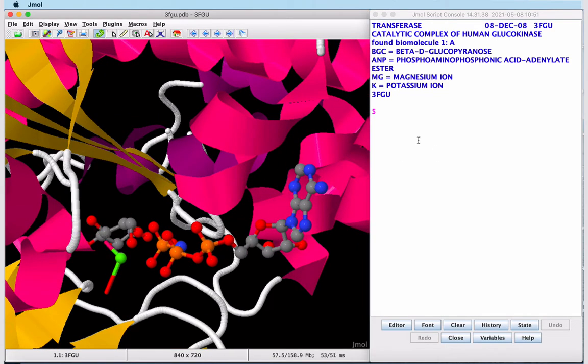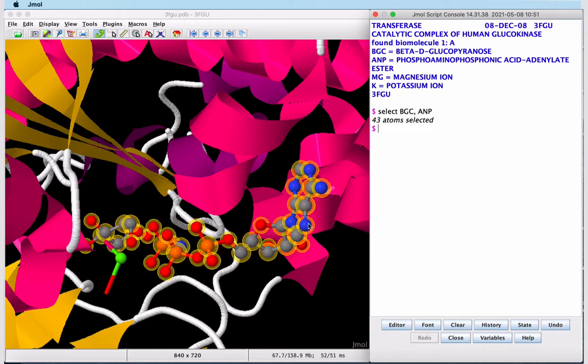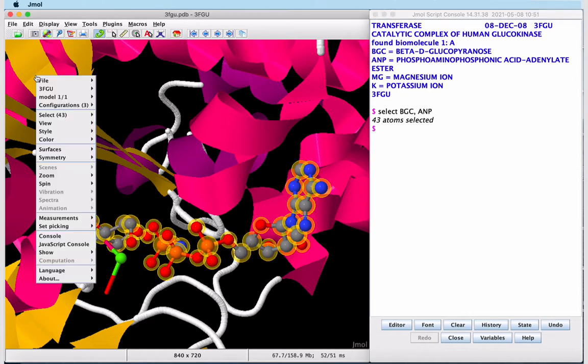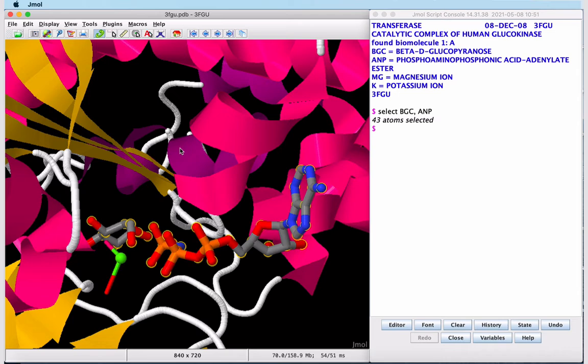The easiest way to select multiple ligands in JMol is using the console. We want to select both of our small molecule ligands to show them as sticks. With these two ligands selected, we can enter the pop-up menu again, select Style, Scheme, Sticks, and now they're shown in stick representation.